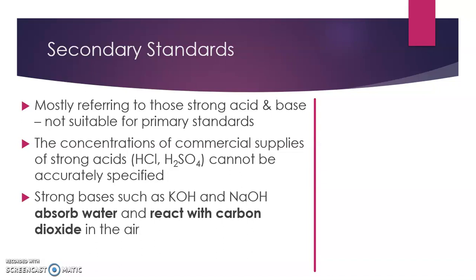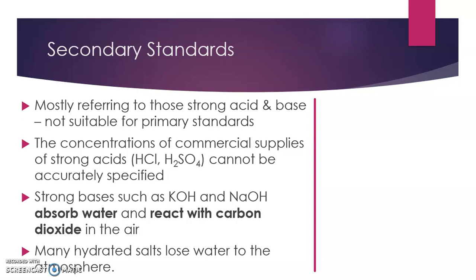And the strong bases such as KOH and NaOH, they're solids, but they absorb water and react with carbon dioxide in the air. As we said, primary standards cannot react with the air easily. There are also many other hydrated salts we could use, however, they lose water to the atmosphere. Therefore, their formula changes constantly, and it makes it hard for us to actually determine it.